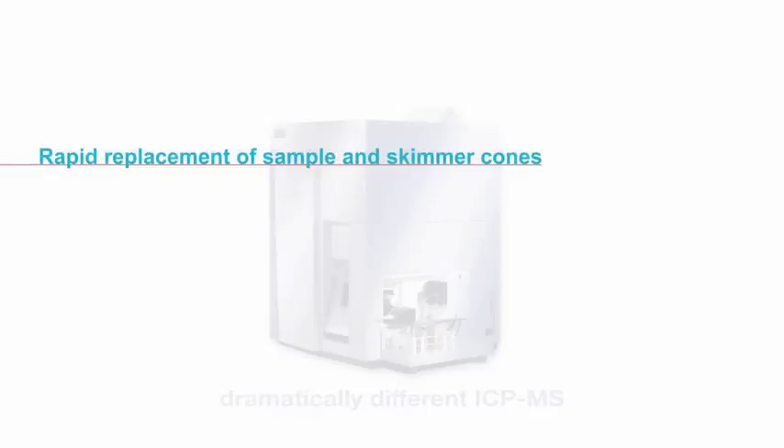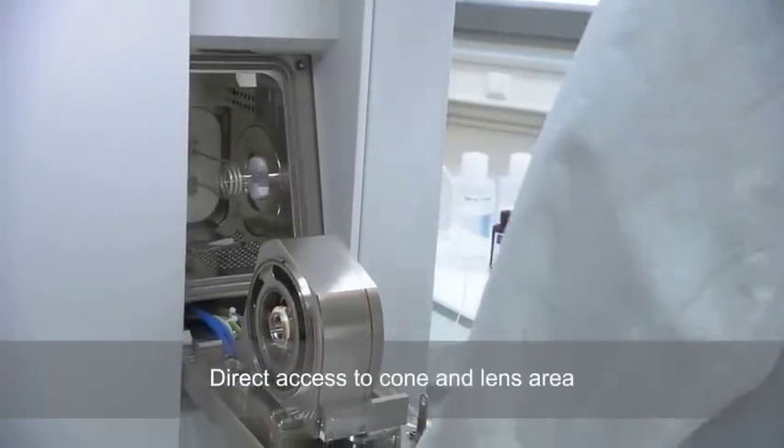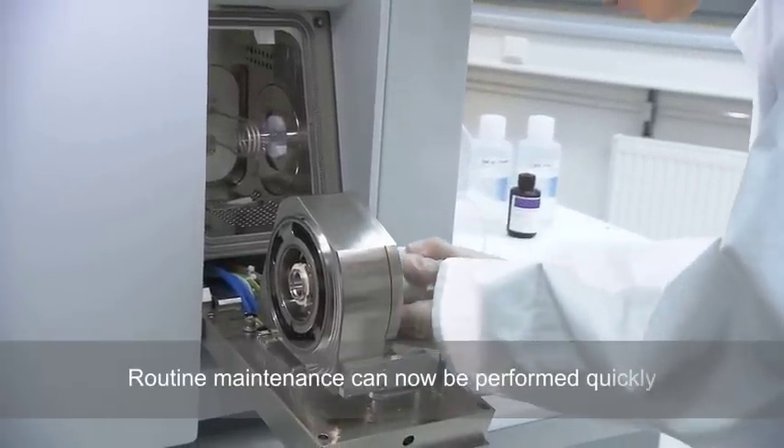Rapid replacement of sample and skimmer cones on the Thermo Scientific iCAP Q ICP-MS. The unique ICP-MS geometry provides direct access to the cone and lens areas, so routine maintenance can now be performed quickly.